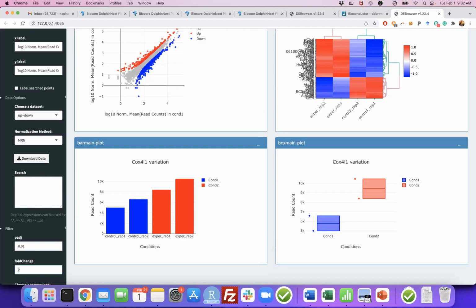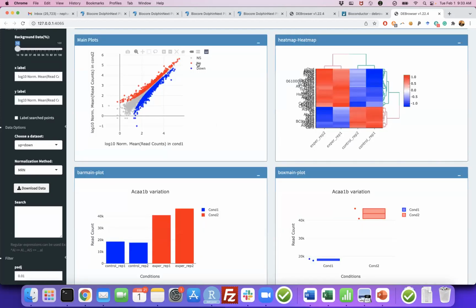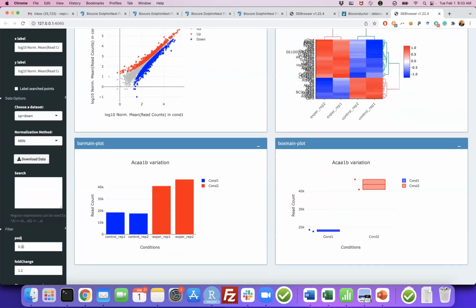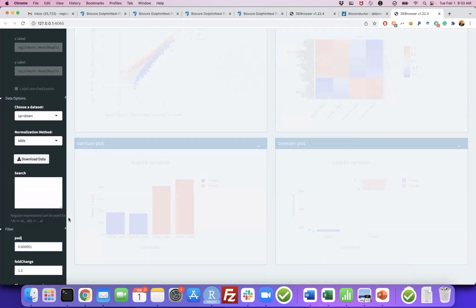That's why sometimes you change this to 1.2, for example, to see whether there are other genes where, even though the fold change is not high, most of the genes are coming here. They look significant, but then you need to decrease the p-adjusted value like crazy, just to see whether there are any tightly regulated genes that might be significant.